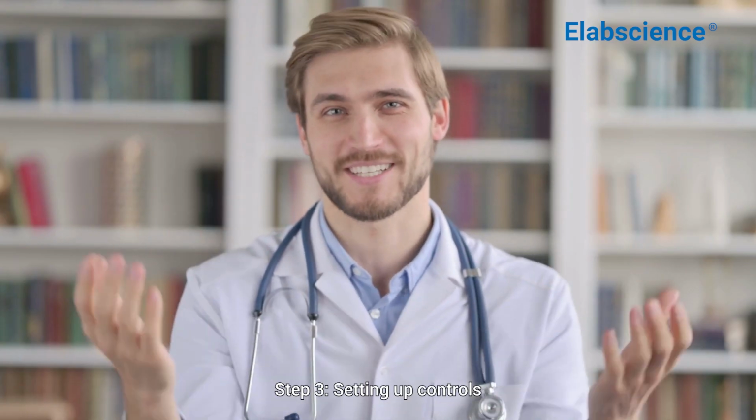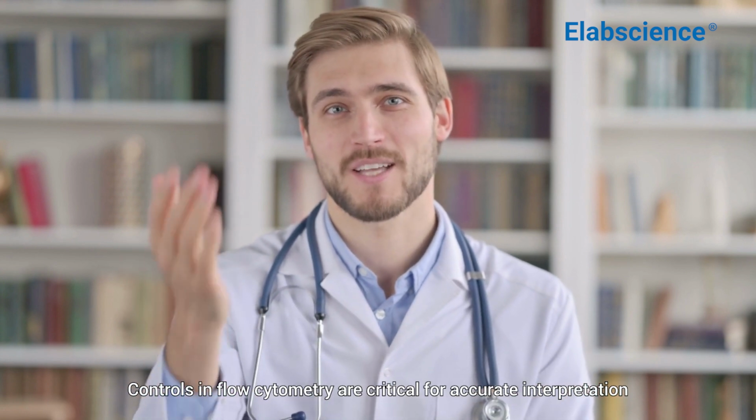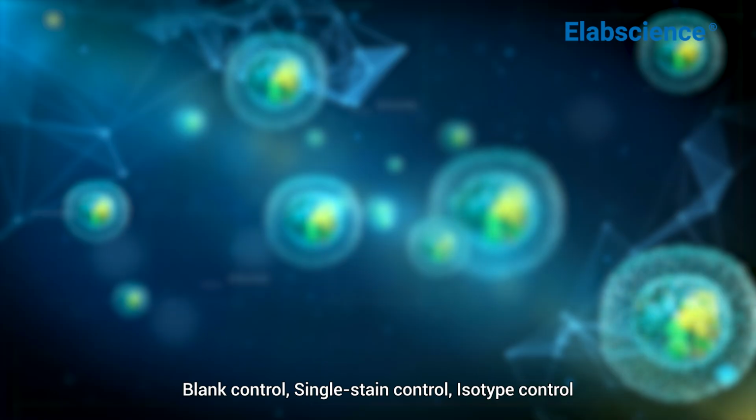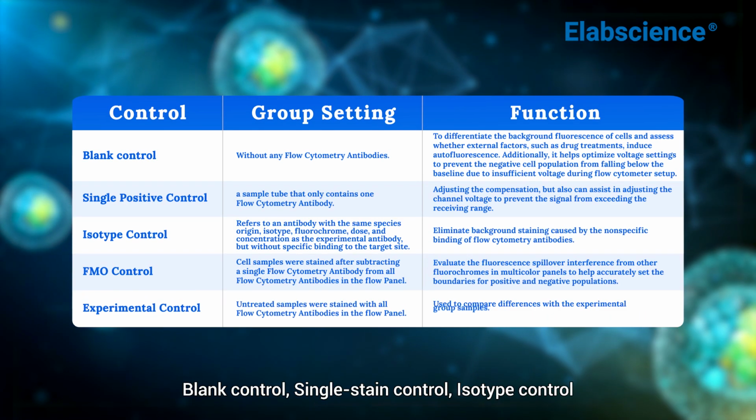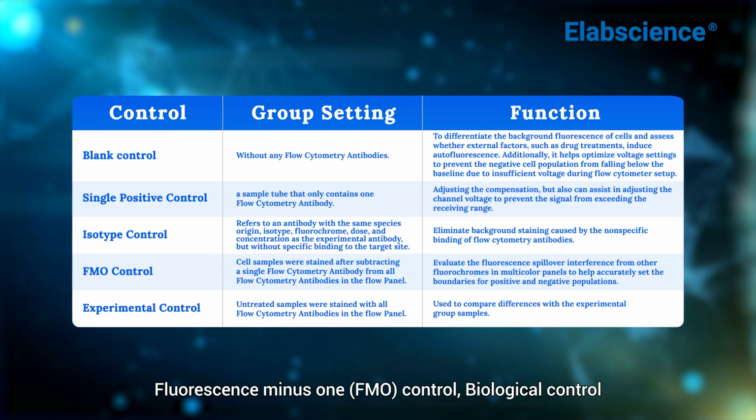Step 3. Setting up controls. Controls in flow cytometry are critical for accurate interpretation and can be categorized into 5 main types: blank control, single stain control, isotype control, fluorescence minus one control, and biological control.